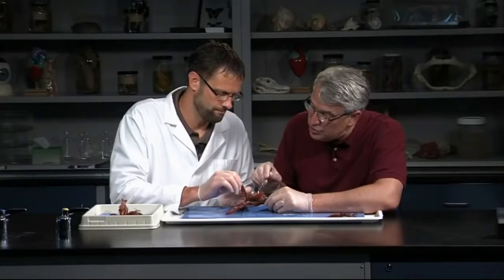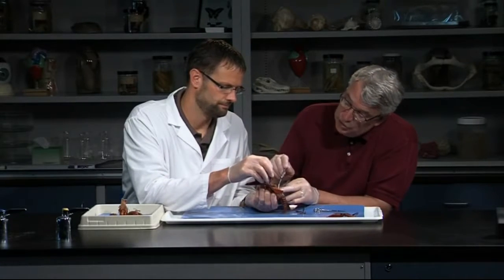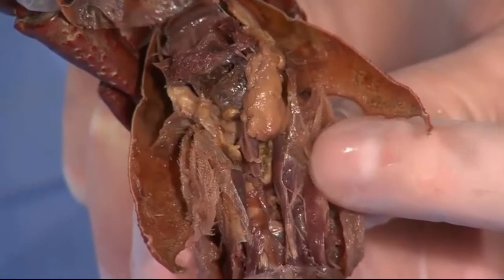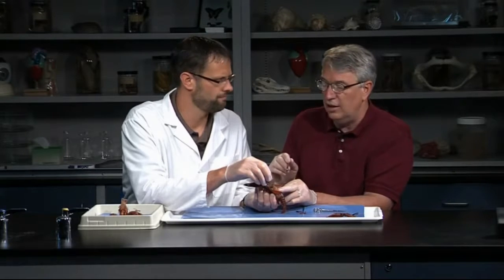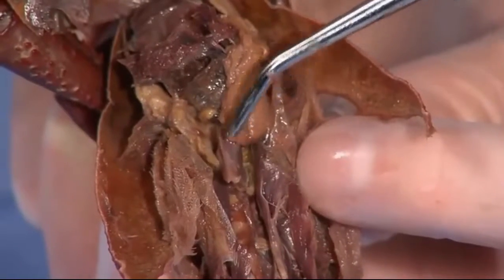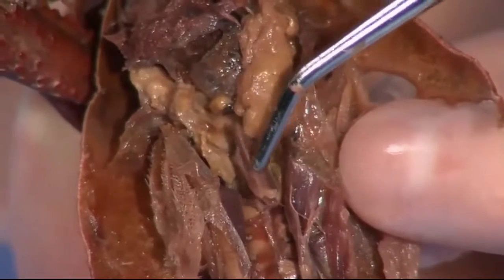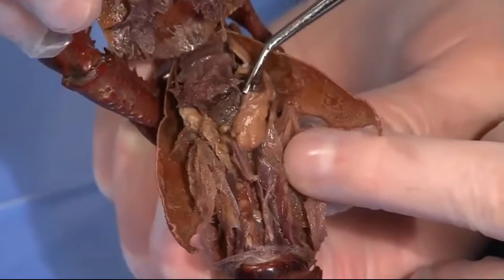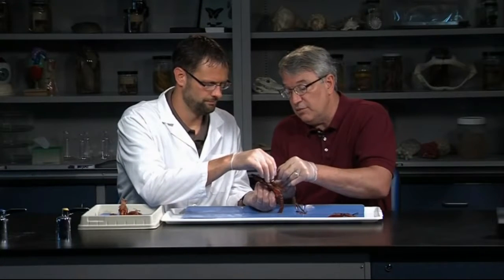You see, the hearts on crayfish are really strange structures. They have an open circulatory system, so they don't have a lot of blood vessels. The heart just keeps things circulating — I call it a hot tub circulatory system. It's like moving the blood around the body, but not necessarily contained within vessels. It has fairly low pressure, but a lot of their needs are met by that system, particularly with the small body size that they have. You can see the heart right here. It's got a little hole in it called the ostium. It'll be a pinkish, whitish structure, sitting right there behind these large digestive glands.